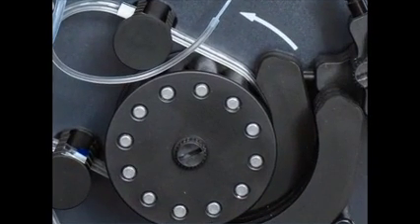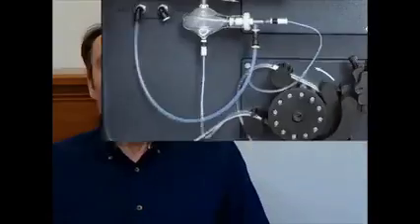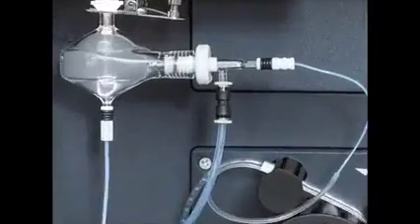So we use a pump. In fact, it is a peristaltic pump, which will push the solution towards the next component in the sample introduction system, which is called the nebulizer. Along with the pump and a flow of argon gas going into the nebulizer, what comes out of the nebulizer is an aerosol.